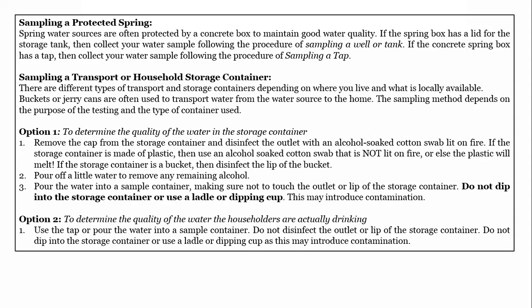How do you do it? Presently, the first option, if you want to know what particular test to use to identify if there's a contamination in the water itself, or to know if the people are actually drinking contaminated water, there are two procedures to test.